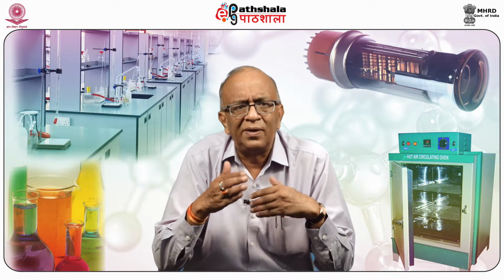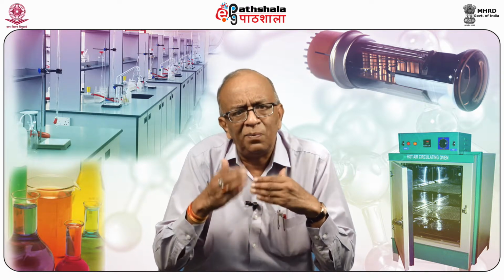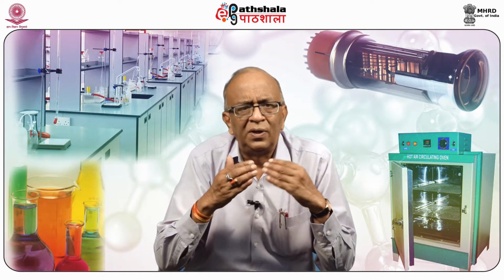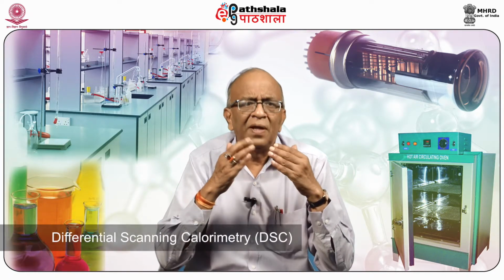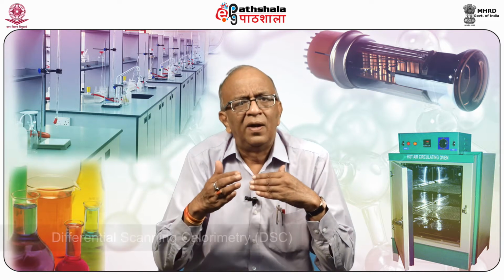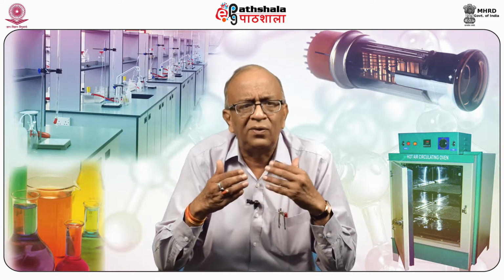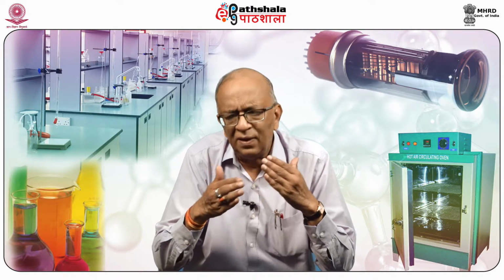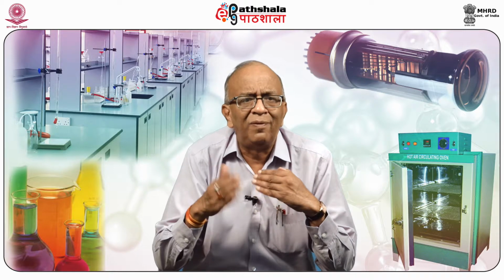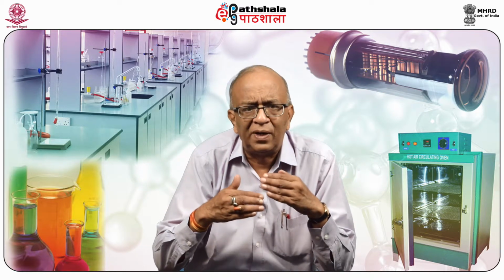Next type of thermoanalytical technique is DSC. This is not differential thermal analysis, it is differential scanning calorimetry. The instrument which we will use for measurement is a calorimeter.